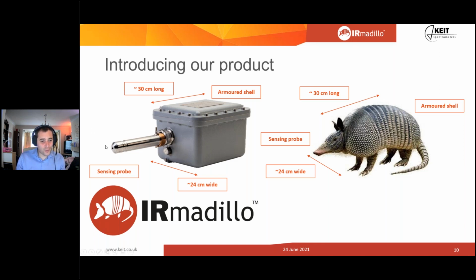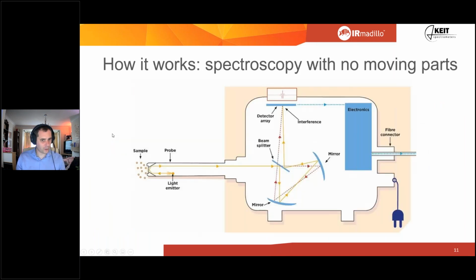And just to show you, this is the ATR here. It's just a piece of diamond that just does the sensing. So that gets installed directly into the process. So how does it work, and then how do we go on to use it?